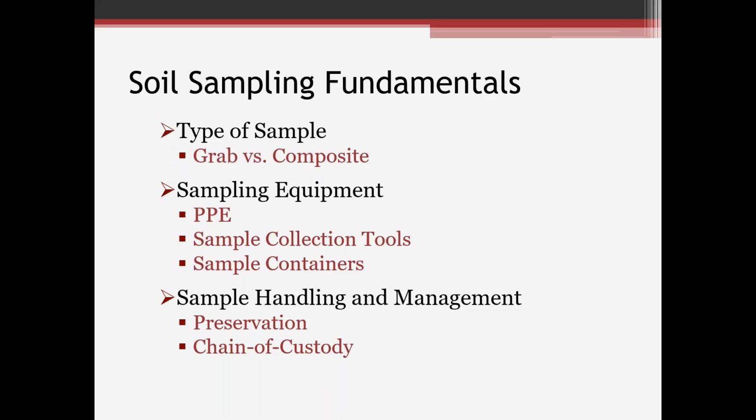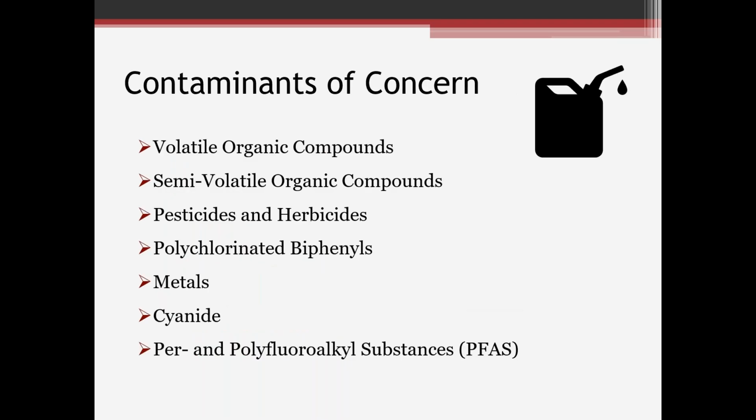So pay attention to all that, making sure everything's on the up and getting good quality data when you're doing the sample analysis program. Of course, chain of custody: we want to make sure that the sampler has full chain of custody procedures from the time they sample right on through to delivery and analysis, so we know exactly who was handling those samples through that process.